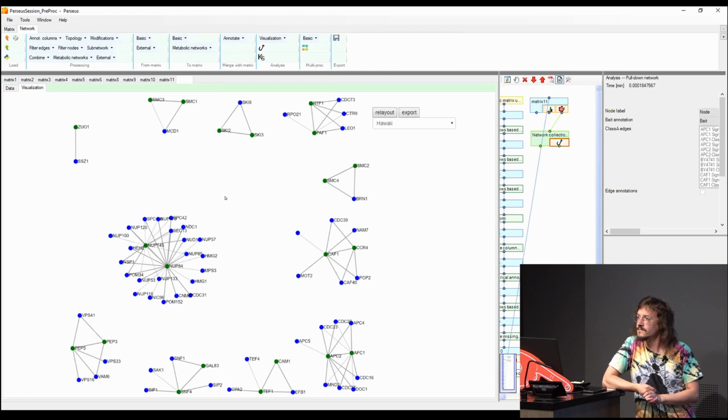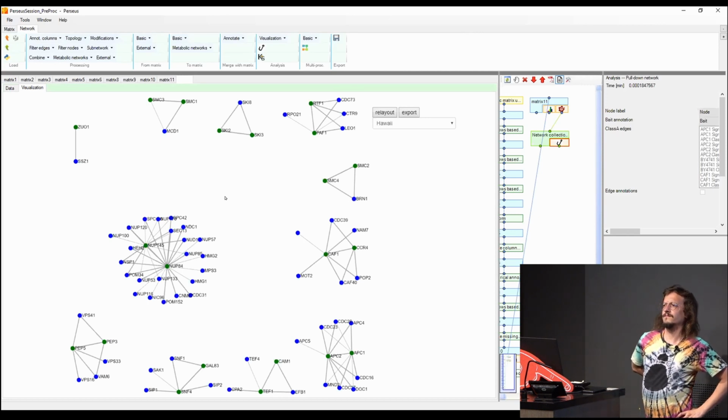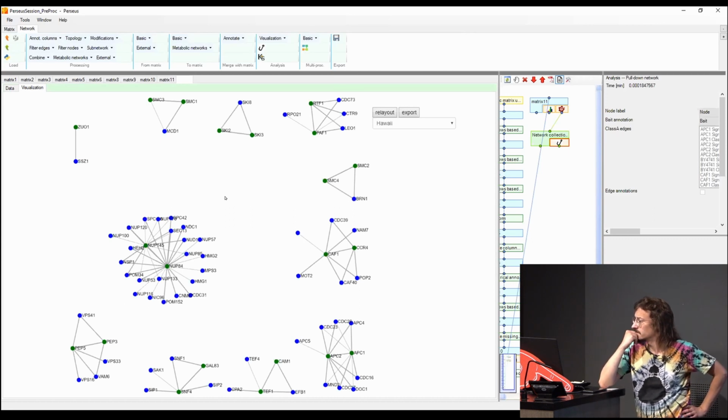Coming back to the issue of some interactions maybe not being as significant as others, you mentioned you could use the profile plot to check those interactions further to see if they were non-specific binders, or if they're maybe specific binders but there's not lots. So when creating the network, can you tell Perseus to take that into account, or is that something you have to do manually? No, you have to do that manually.